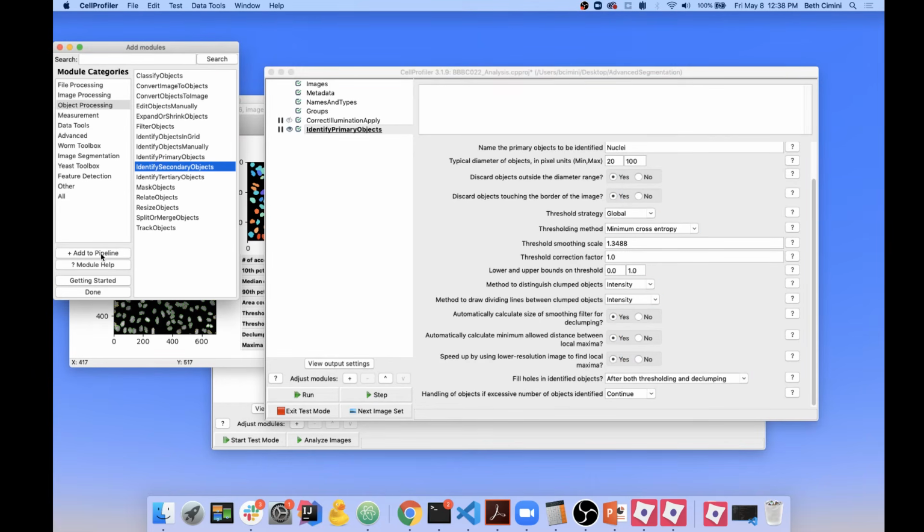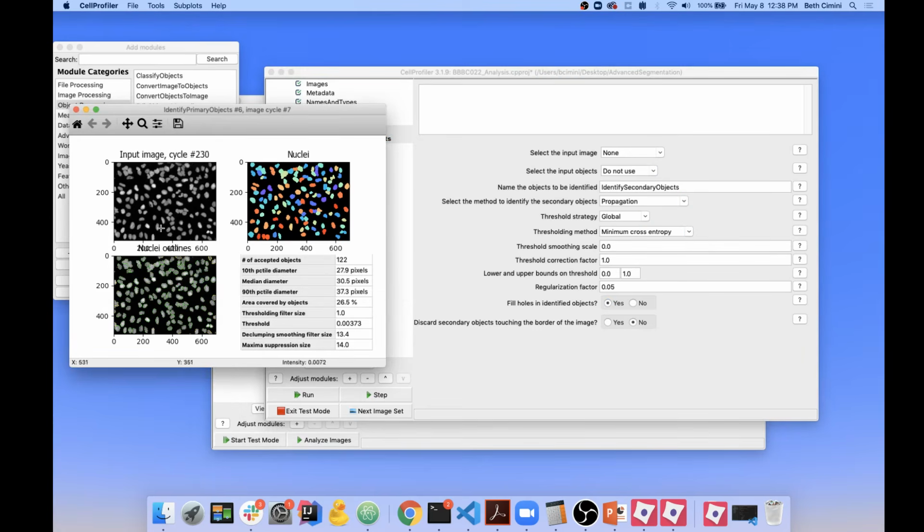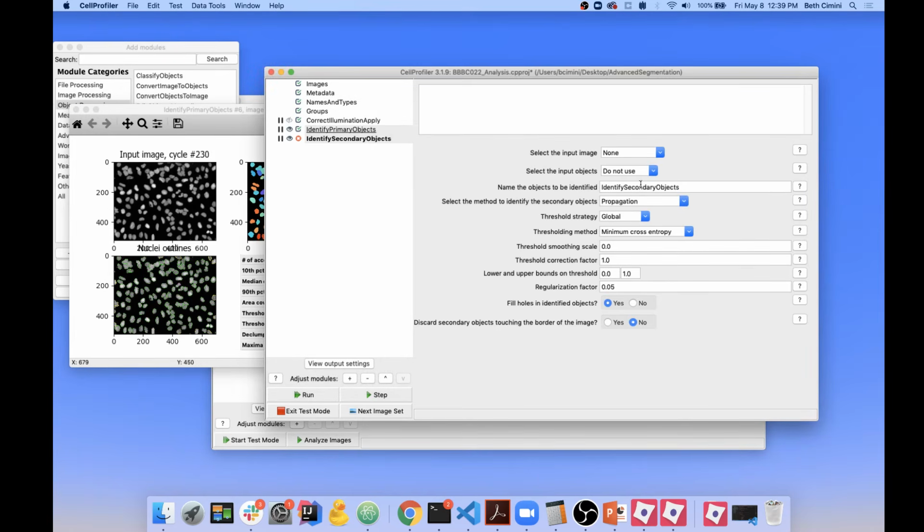Now, CellProfiler also has the concept of a secondary object. A secondary object involves taking a primary object, such as a nucleus, and building something around it, like a cell body. Now, this isn't something that you need to do in every experiment, but if you start by identifying nuclei, which is typically a lot easier than identifying cells themselves, this gives you a really powerful option to make sure in a mononucleate cell line, or any case where each one cell does correspond to one nucleus, you can make your identification process a lot more smooth by starting from the nuclei and building around them.